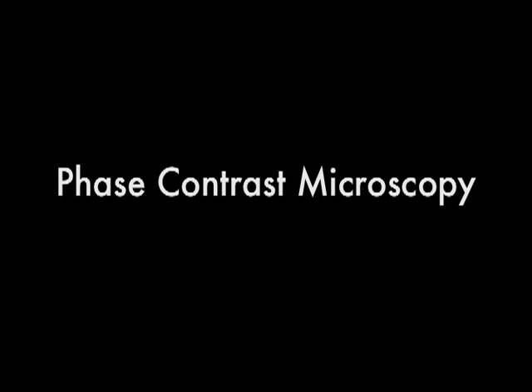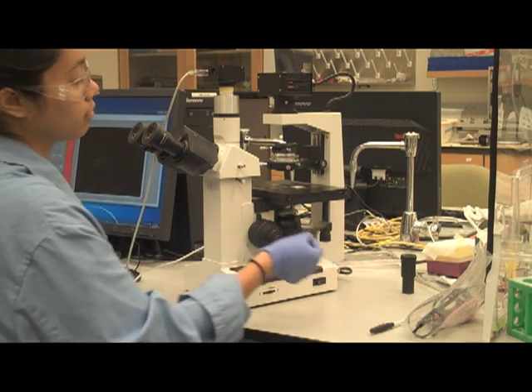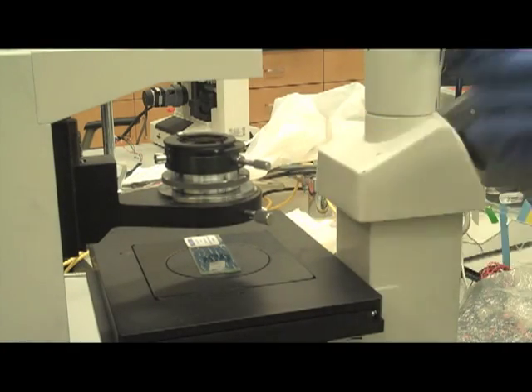If you would like to use phase contrast microscopy, simply follow these five additional steps immediately after focusing your specimen in bright field. Step 10: Locate the annular diaphragm slab, which should be sitting next to or around the microscope station.